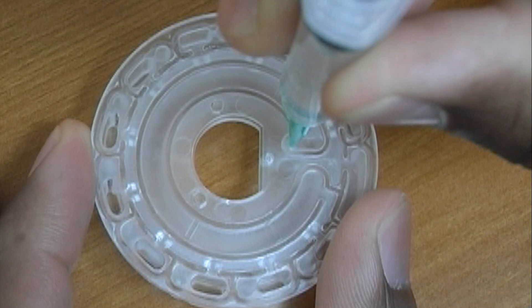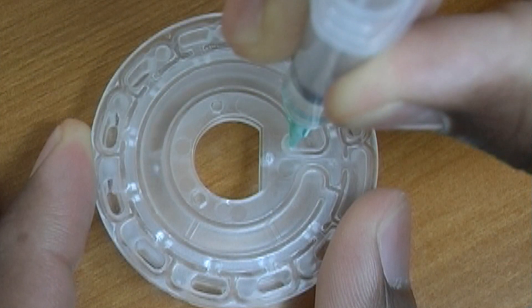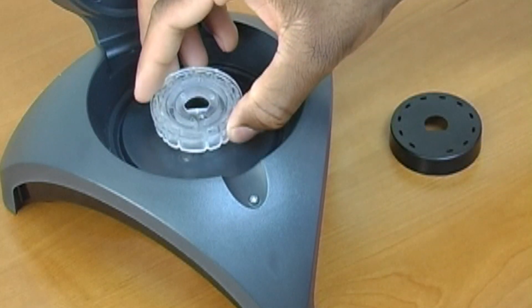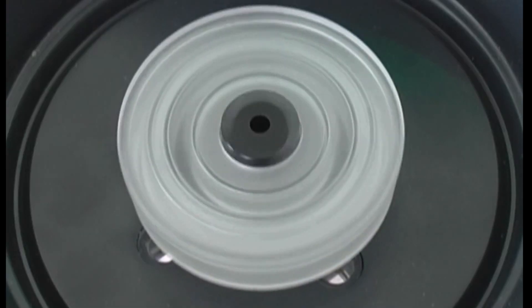So, how does it work? First, a three milliliter sample of water is injected into the disc. Then, the disc is placed into the spin meter with a protective shield to control the flow of light.